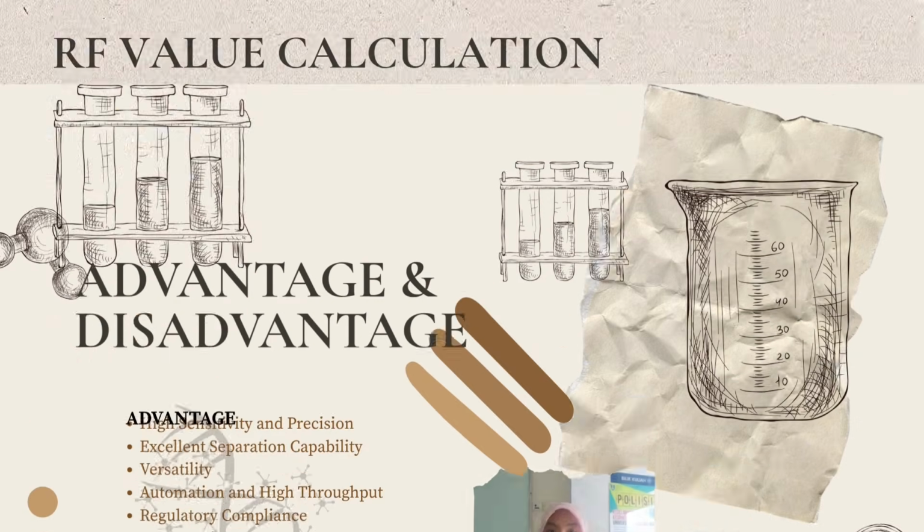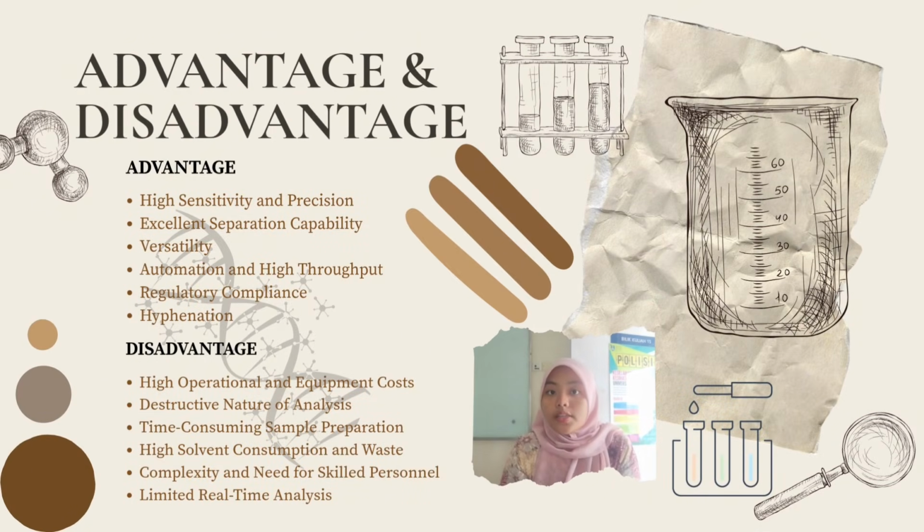Okay, now we are talking about the advantages and disadvantages of chromatography in pharmaceutical analysis. For advantages, we have high sensitivity and precision, where the chromatography technique can detect and quantify an active pharmaceutical ingredient, and the impurities, even at extremely low concentration.